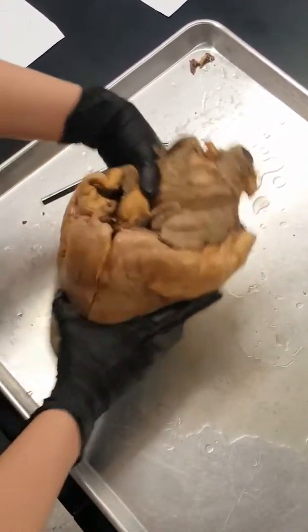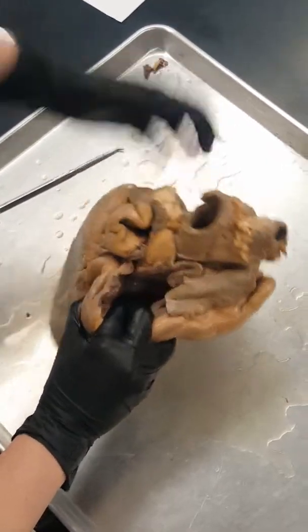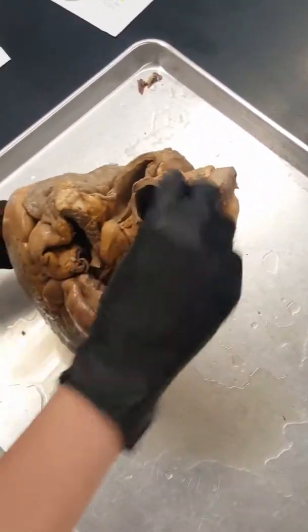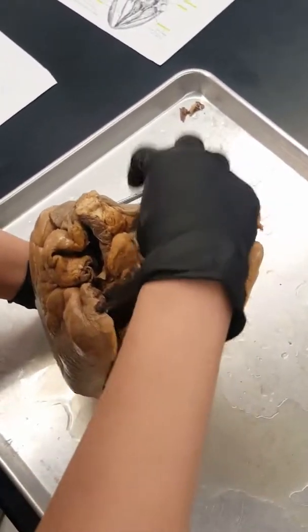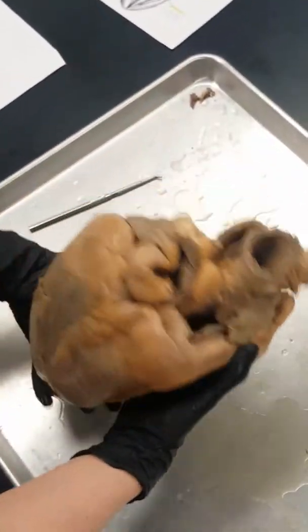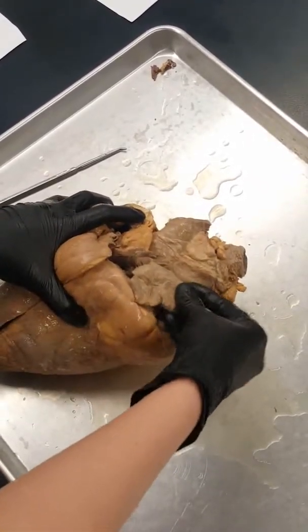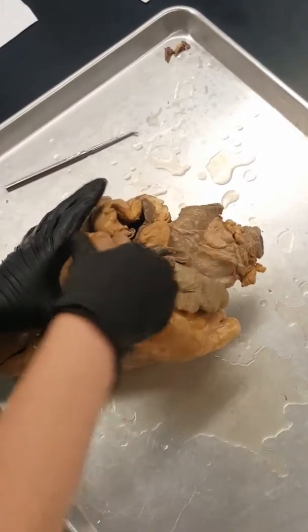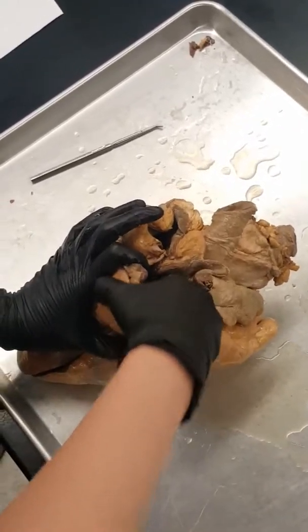The interventricular sulcus is this little line that separates the left and the right. Up here is the left auricle — the auricle is just the name of the pouch, so the left auricle is the pouch, and then inside is going to be the atrium. This big opening up here is going to be the pulmonary trunk.